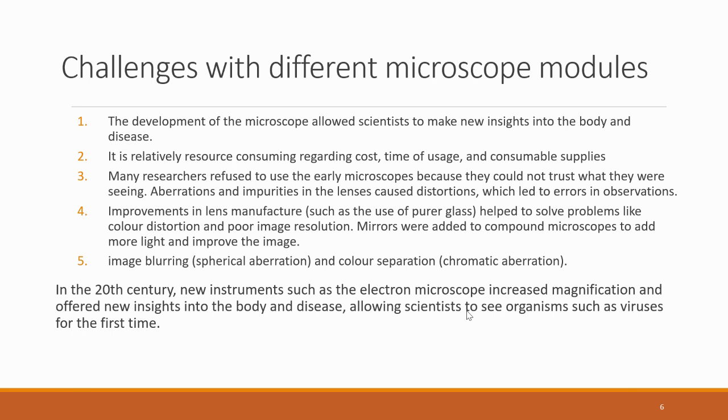So let's talk about why there are challenges with different microscope modules. First of all, the development of the microscope allows scientists to gain new insight into the body and disease. By inventing new microscopes, we are able to see some parts of the cells or sample, and also we can observe the disease. That's why there are always challenges with the different microscope modules.